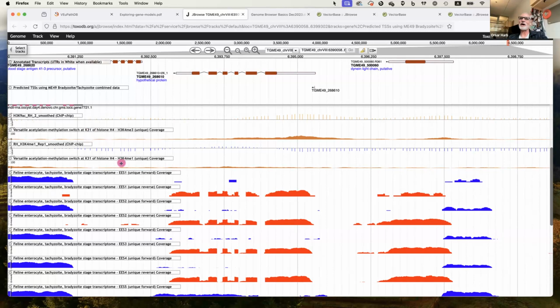Okay. So ChIP and ChIP-seq are basically the same. The concept behind it is the same. You're taking DNA that's bound to a protein, and you're using an immunoprecipitation with an antibody to that protein of interest. And then somehow you're detecting what DNA was bound to that protein. So the detection method is what distinguishes ChIP and ChIP-seq.